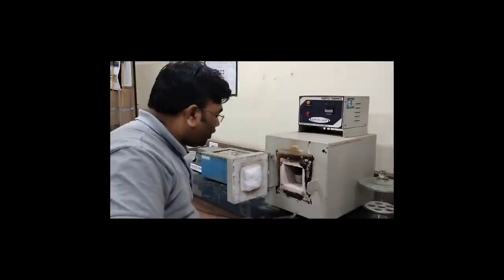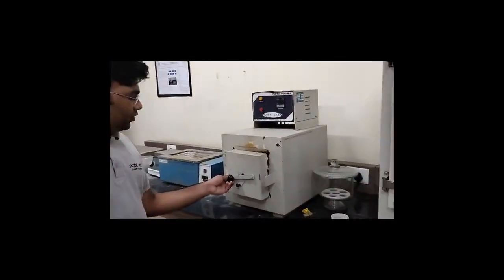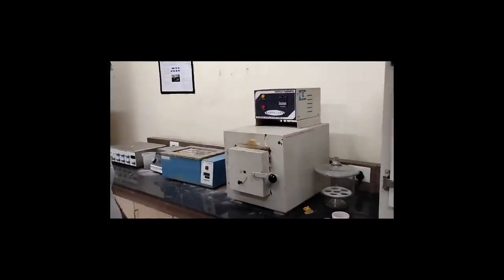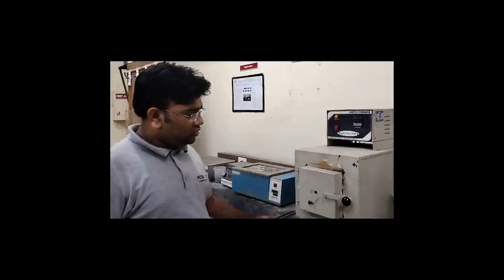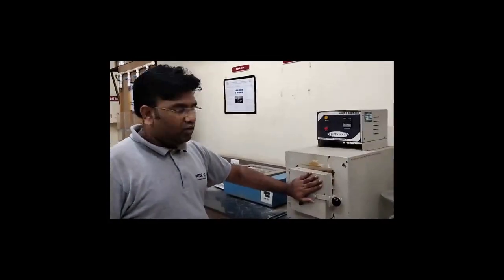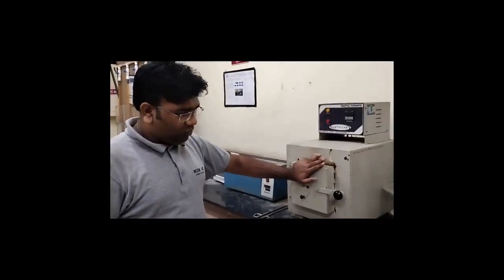Now we are going to start this muffle furnace and keep these crucibles for half an hour at 550 degrees Celsius, and after that we are also going to measure the weights. I'll be measuring the weights at the same time.